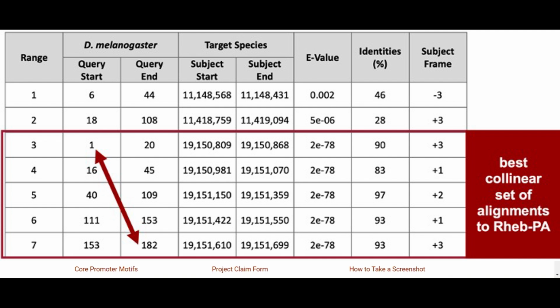The initial tblastn search we performed in Part 2 helped define the search region for the putative ortholog within the genomic scaffold of the target genome, yakuba. The next step in our analysis is to determine the approximate coordinates of each coding exon, or CDS, of Rheb-PA in yakuba. The approximate coordinates of each CDS can be determined by aligning each CDS of the gene in D. melanogaster against the search region of our target genome. To do this, we will utilize the Gene Record Finder and BLAST.